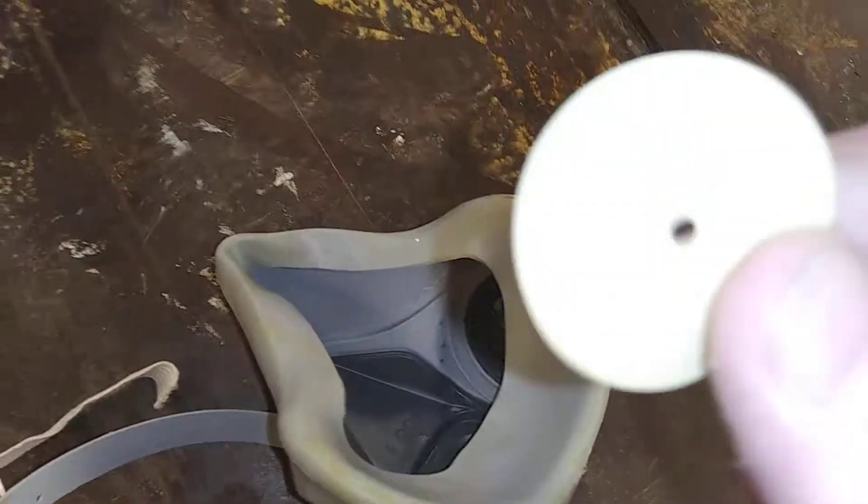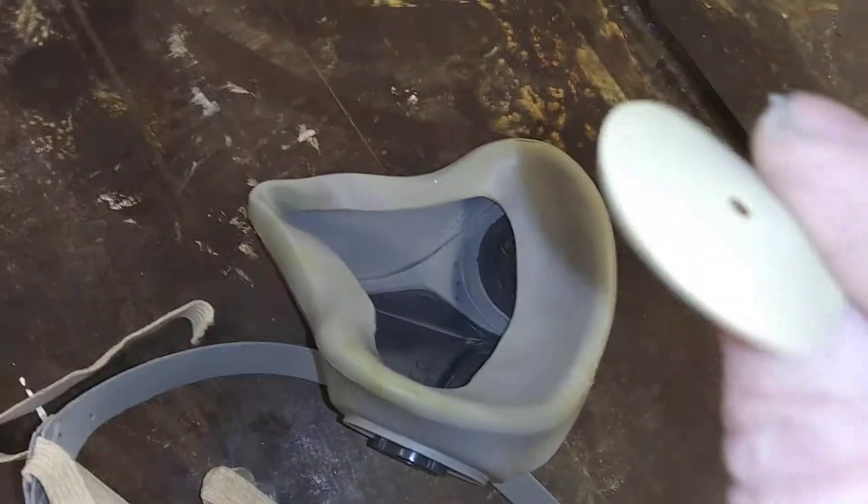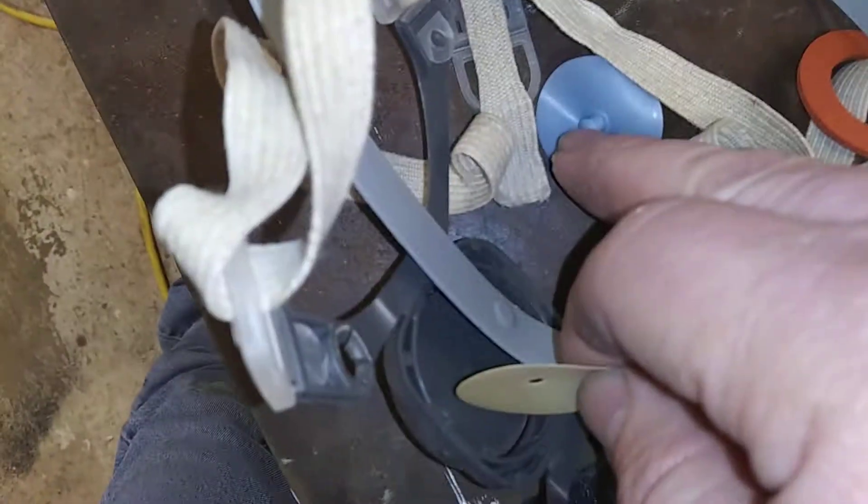Good news is you can go online and get parts for them. You'll take these out as well — I'm gonna pause this so I can get it out. All right, I got that out. See what that looks like? These are air flaps. You need to clean both sides and let it dry, just like you do on that.